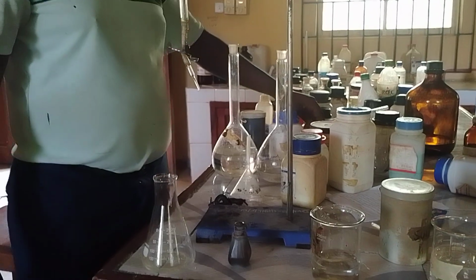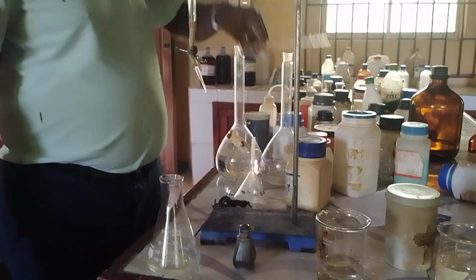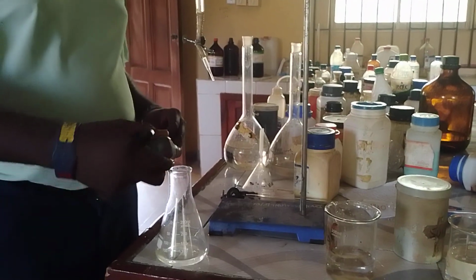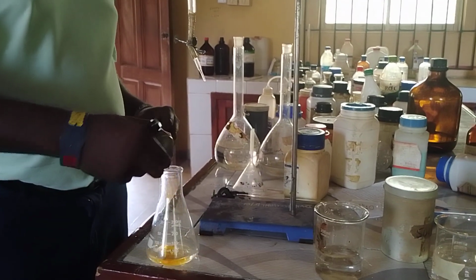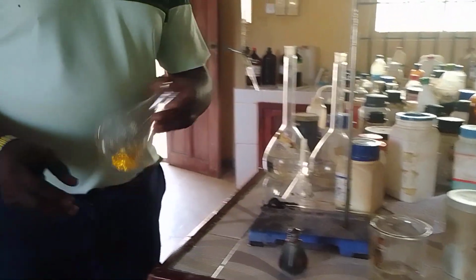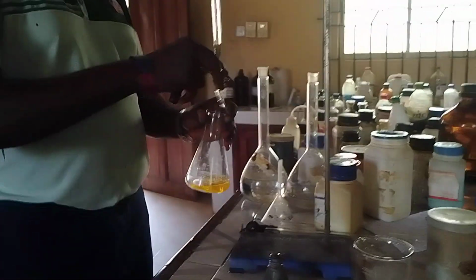Then after that, I put my methyl orange, 2 or 3 drops, and I have it there. So then I titrate.